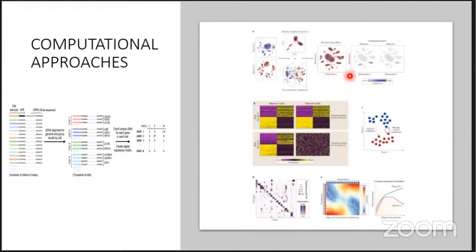So you can see these clusters and how many dots are there in each cluster. That many number of samples and the cells will be there from each sample. So you can see that this is one sample, this is one sample. We will see all these things in detail.